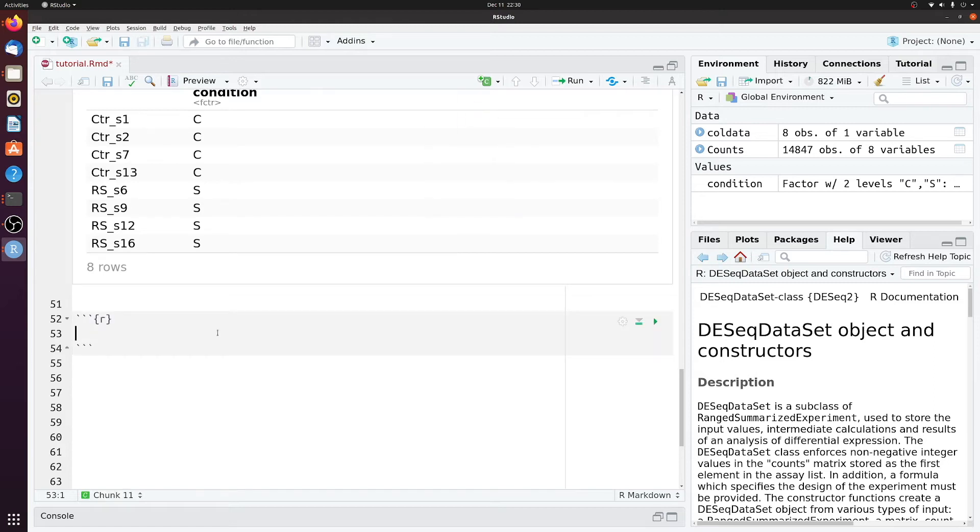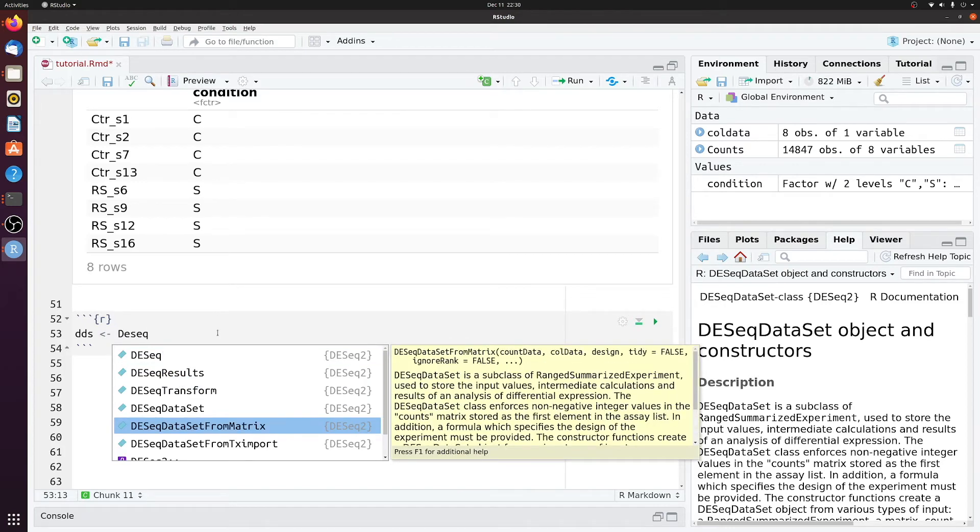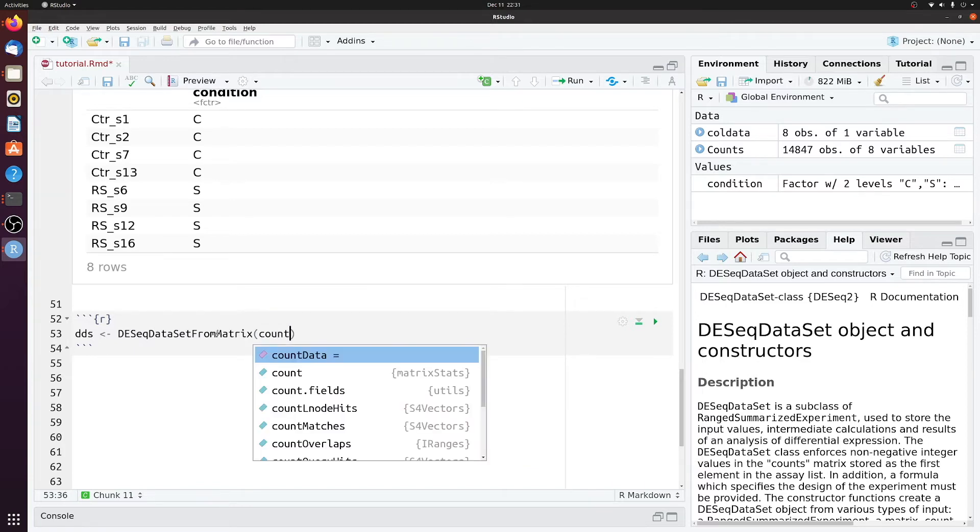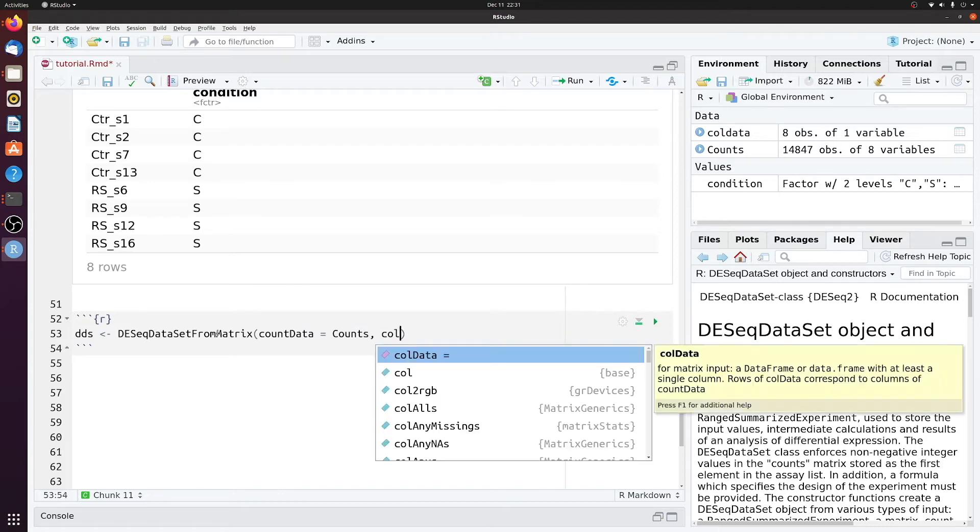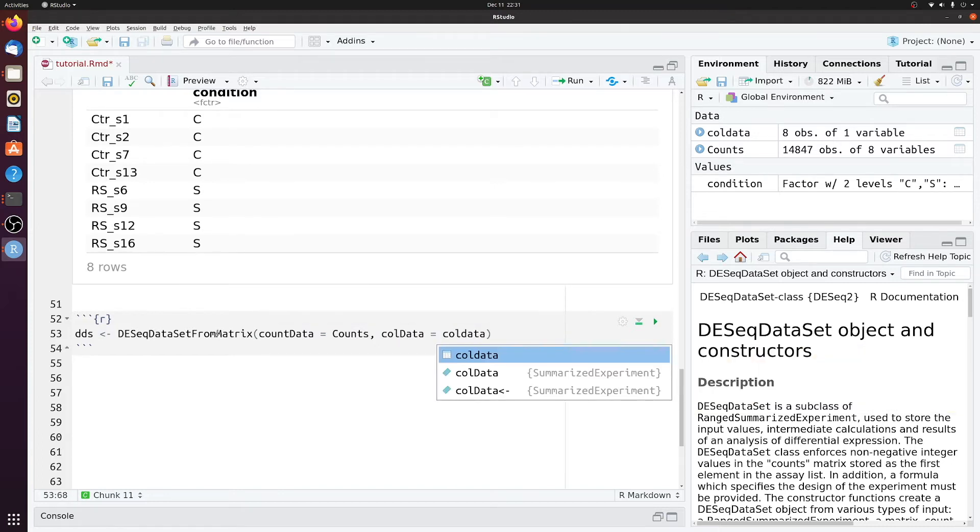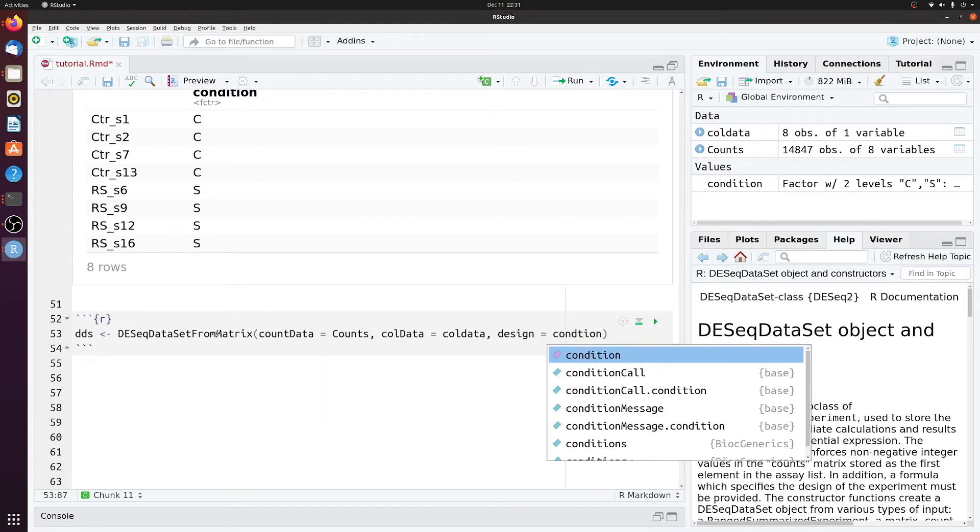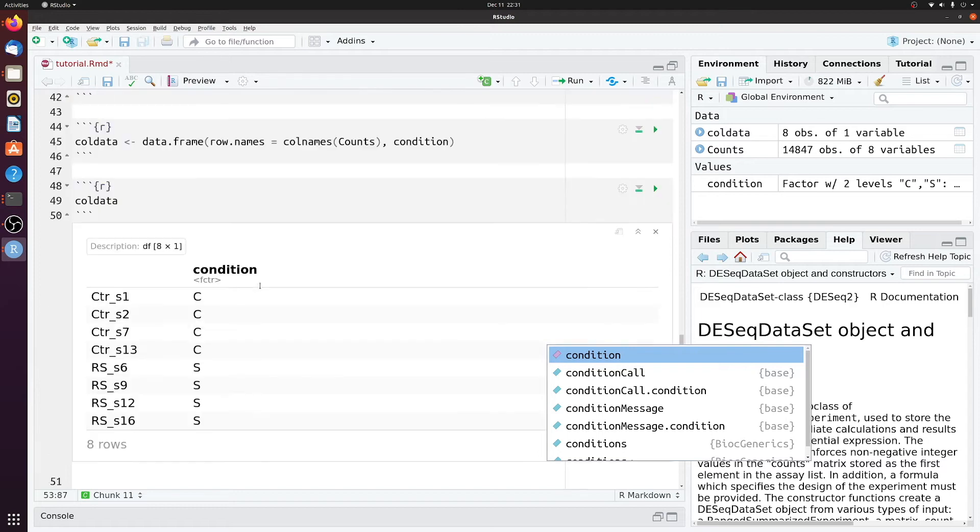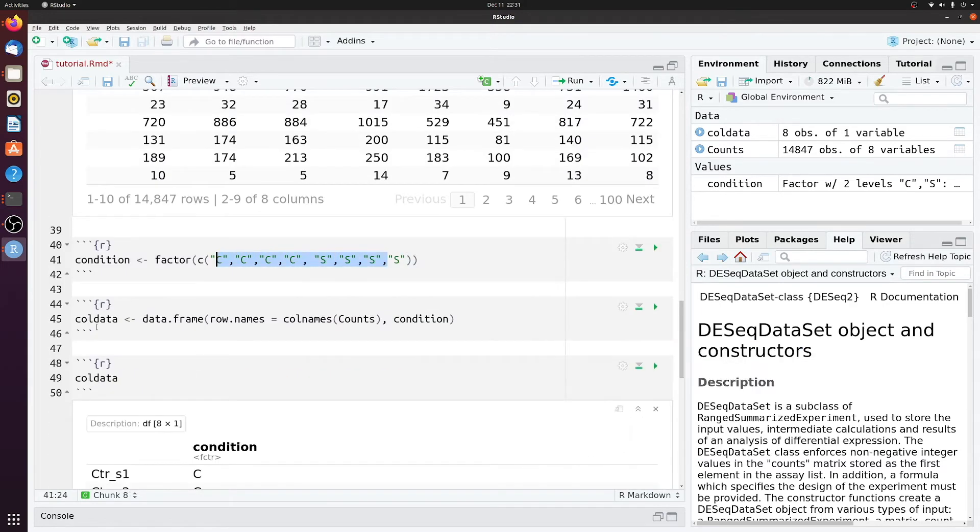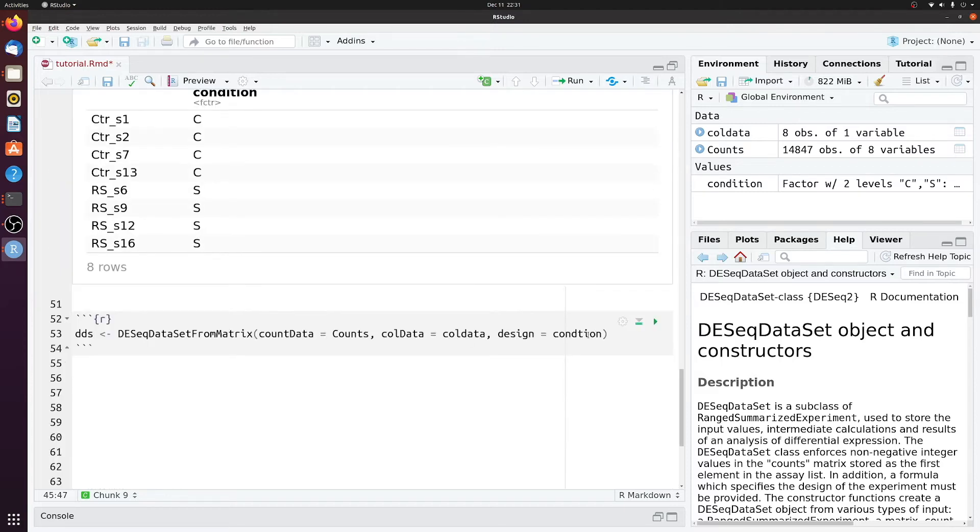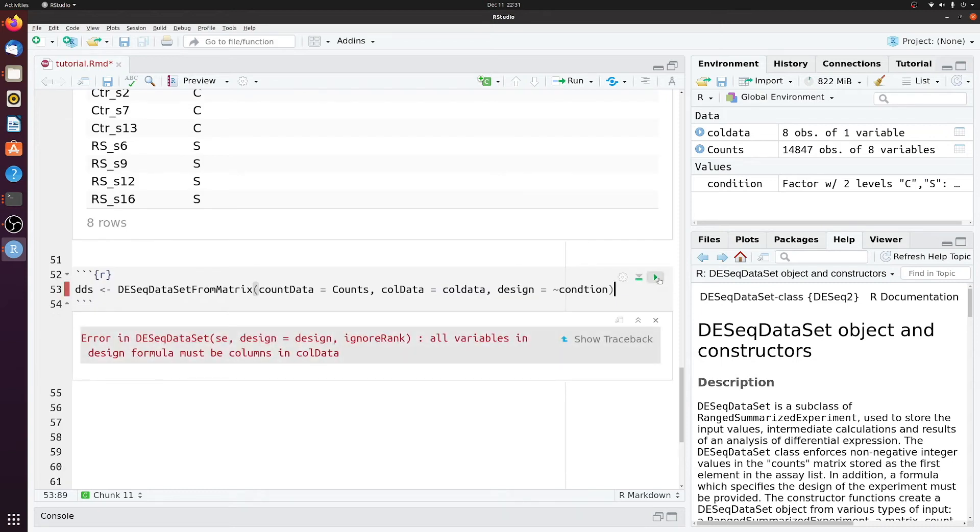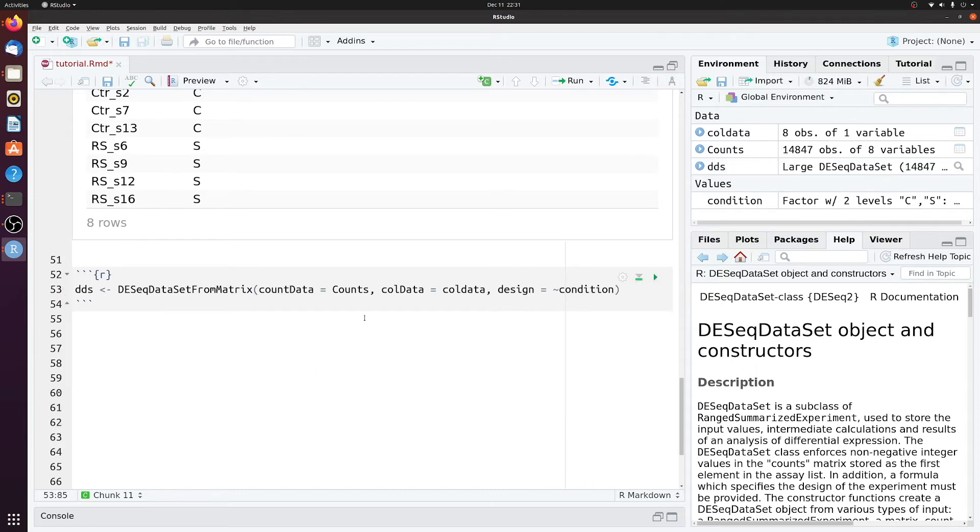So next using this and the count matrix, we'll actually start calling some DESeq functions. So we'll make an object called dds. And we'll call DESeqDataSetFromMatrix here. And our count data is of course counts. colData is colData. And our design is condition. Remember condition was this here. And colData was this here. And we also need to put a little tilde there. And we should be able to run this. Just made a little typo here. Okay, so we have dds now.